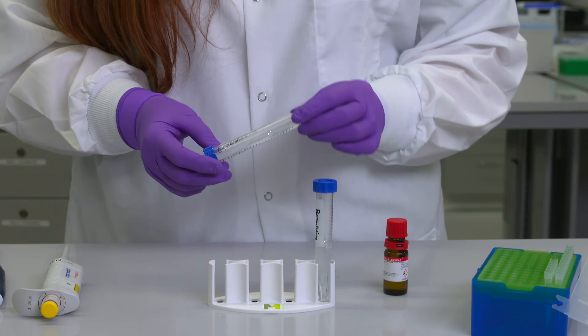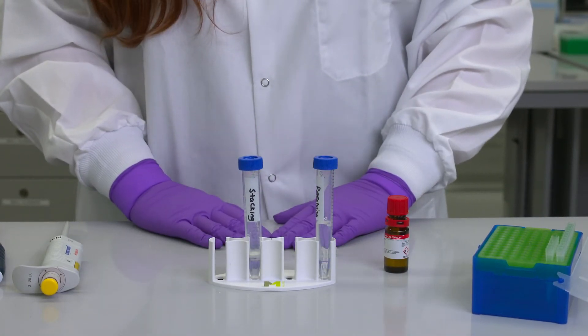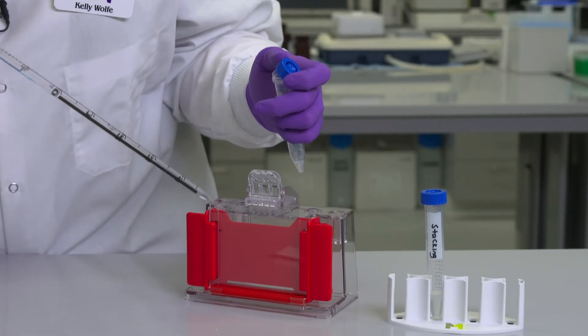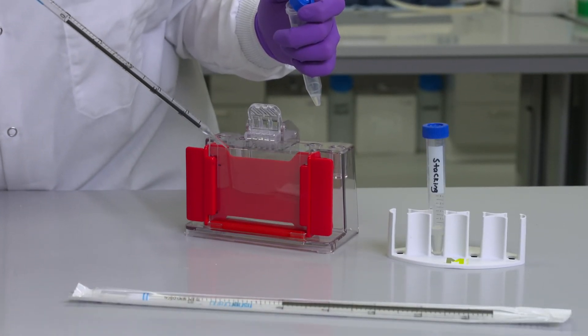Once APS and TEMED are added the gels will begin to polymerize, so gels should be poured quickly after this step. Now I will fill the cassette with resolving gel to the marked height.